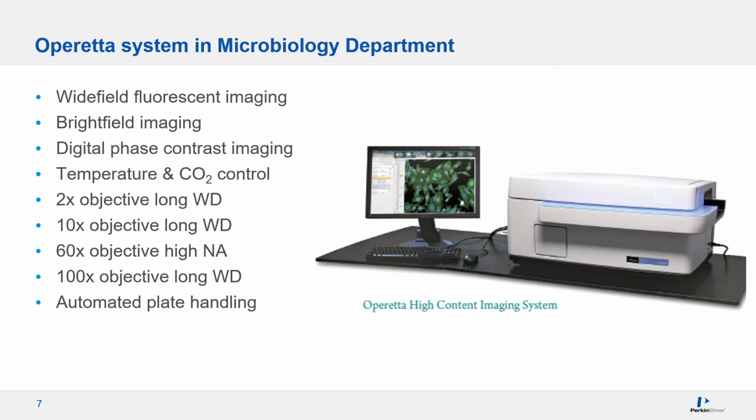Now I would like to introduce you to Operetta, the high-content imaging system in the Department of Microbiology. It is capable of doing wide field fluorescent imaging, as well as bright field and digital phase contrast imaging. It also has a temperature and carbon dioxide regulation unit that enables live cell imaging experiments. And it is fitted with objectives of different magnification shown here. And it also comes with a robotic arm that automates your plate handling of samples for imaging on the system.